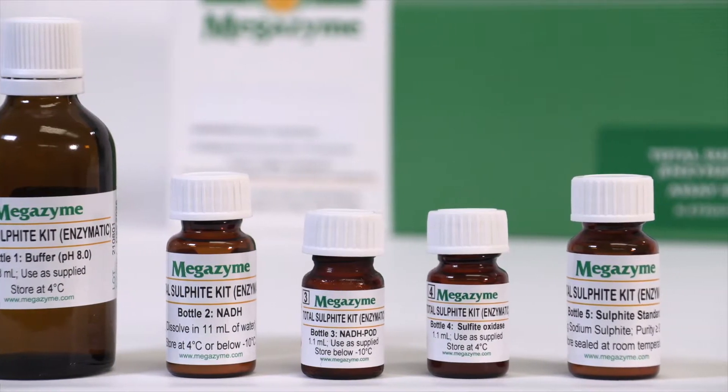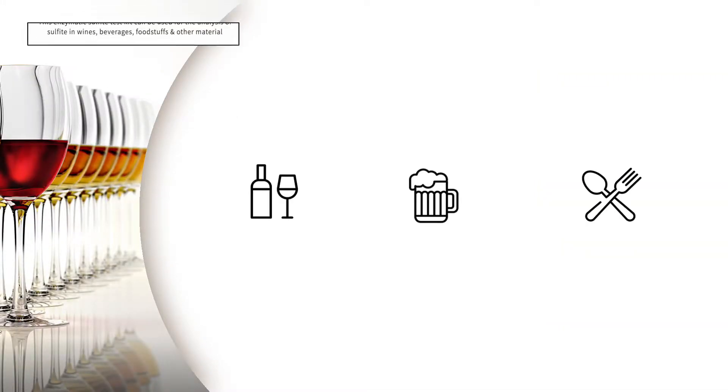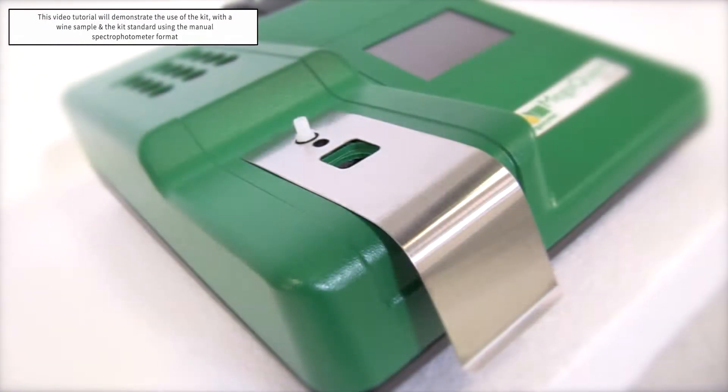This enzymatic sulphite test kit, KET-Sulf, is a simple, highly specific and reliable enzymatic method for the measurement and analysis of total sulphite as sulphur dioxide in wines, beverages, foodstuffs and other materials. The KET-Sulf acid kit will quantify both free sulphites in solution and bound sulphites to provide a total sulphite measurement. This video tutorial will demonstrate the use of the kit with a wine sample and the kit standard using the manual spectrophotometer format.